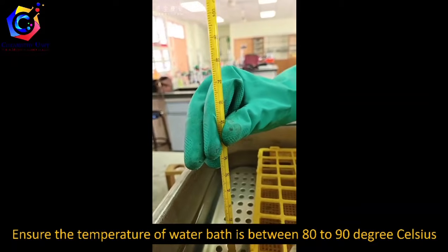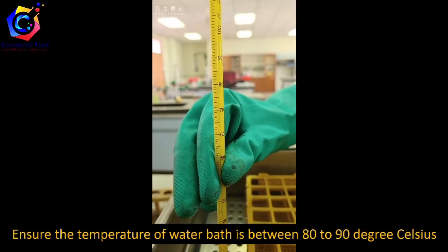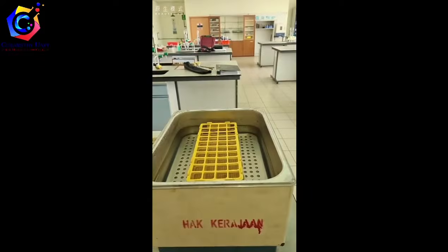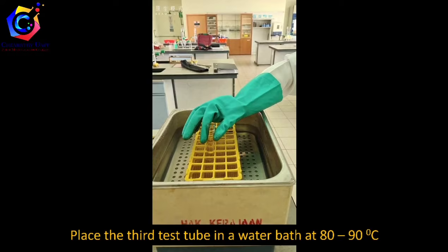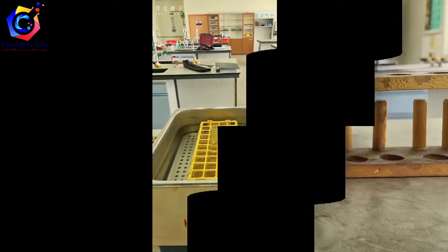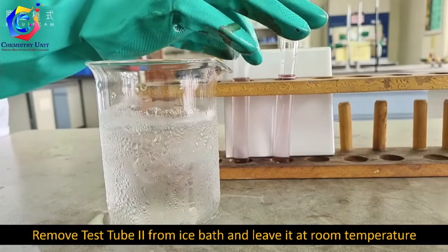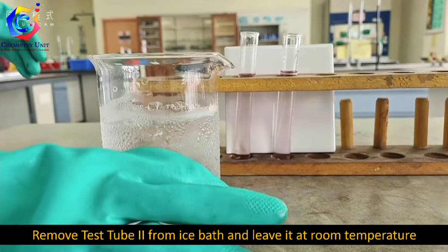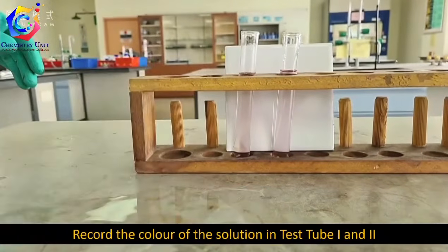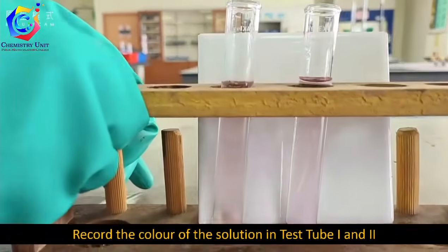Ensure the temperature of the water bath is between 80 to 90 degrees Celsius. Place the third test tube in a water bath within that range of temperature. After some time, remove test tube 2 from the ice bath and leave it at room temperature. Record the color of the solution in test tube 1 and test tube 2.